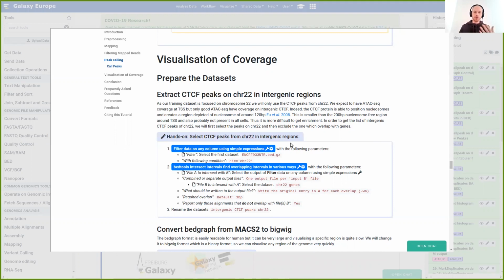So this is our positive control now. We want to see if the peak calling gave us open chromatin sites that correspond to transcription factor binding sites of CTCF, which is something we would anticipate. And furthermore, we will also want to check later on if transcription start sites have a bigger read coverage in our ATAC-seq data than other regions, which we also would anticipate from ATAC-seq data.